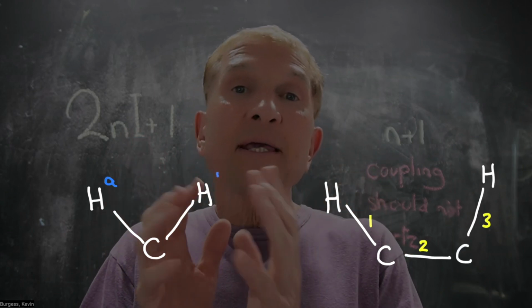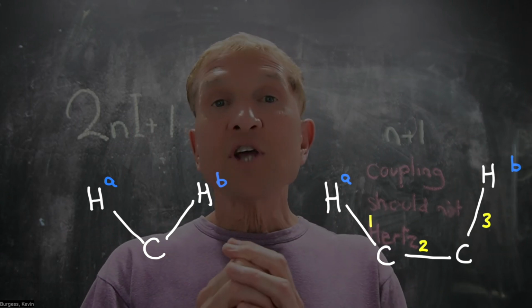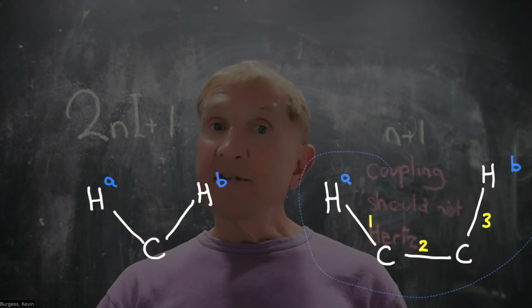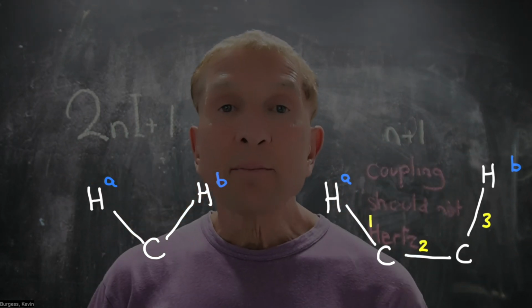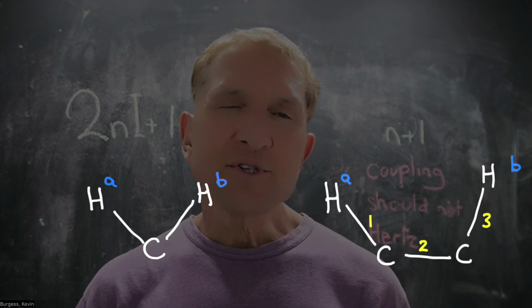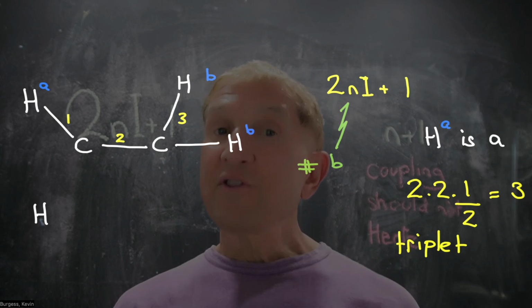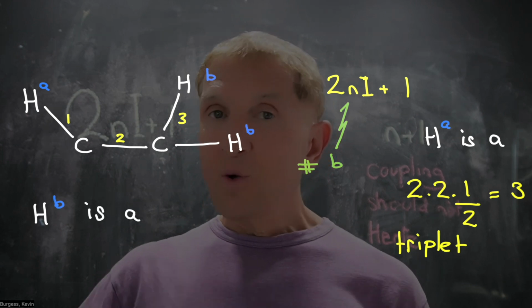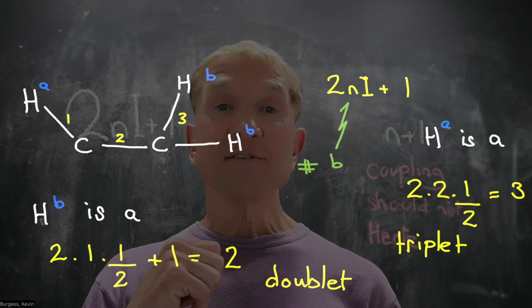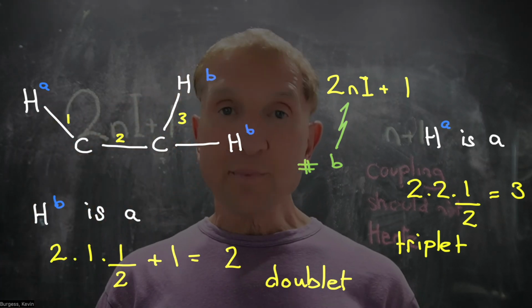The coupling pattern for that spin system is similar, but the JAB coupling constant varies. For spin systems like that, two doublets are always predicted. They can be perturbed, but let's say that for another day. However, for the third spin system we looked at, one HA and two HBs, the coupling pattern is different. A triplet and a doublet is always predicted.